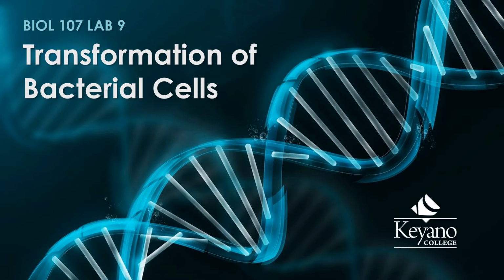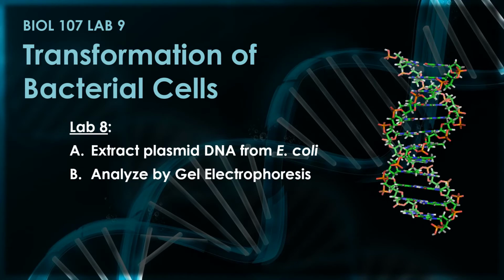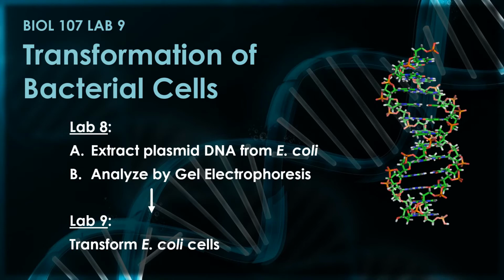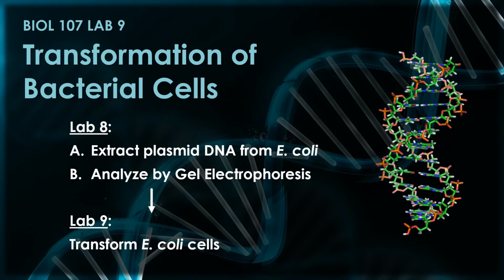Biology 107 Lab 9, Transformation of Bacterial Cells. If you remember last week, Lab 8, we extracted plasmid DNA from E. coli and then we analyzed it by agarose gel electrophoresis. This week, we're going to use the same plasmid and we are going to use it to transform some E. coli cells. Let's talk about what transformation means.